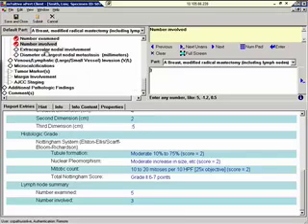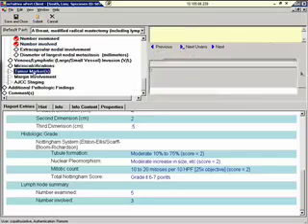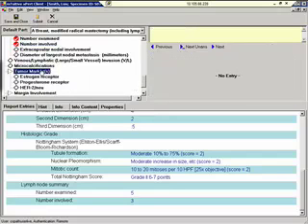Next, I'm going to skip over some of this non-required material. We're going to go to tumor markers. We aren't actually going to fill this section out. I just wanted to mention it as an example of where we have added additional data elements to the standard CAP reports, because all of our clients have asked us to. Using the Agile Author, you can customize templates in reports quickly and easily.